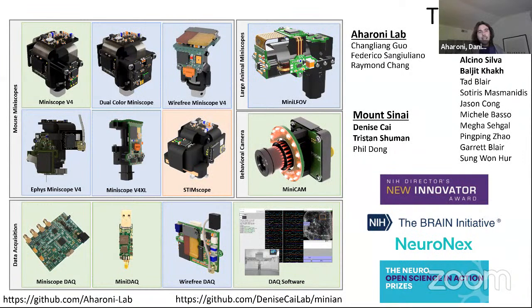I'll finally also say that for some of these tools, like miniature microscopes, they don't have to be expensive. Our miniature microscopes are 50 to 100 times cheaper than the closest commercial option, and that's just the cost of making them. Luckily, NIH and NSF have seen the value in open source tool development and invested in this project. That makes it so that it's not just the top 5% of labs that have $100,000 to buy a tiny microscope, but all the other labs that can afford spending $1,000 or $2,000 to get these tools into their labs.